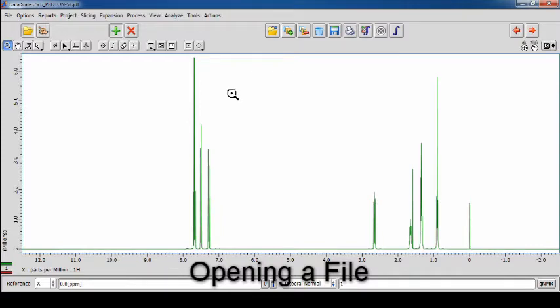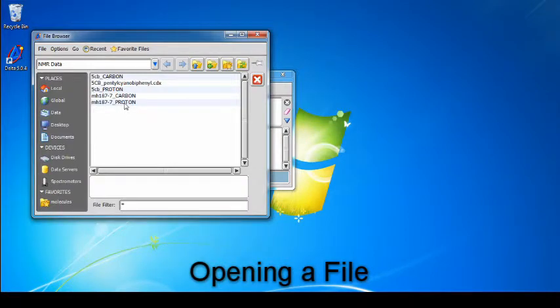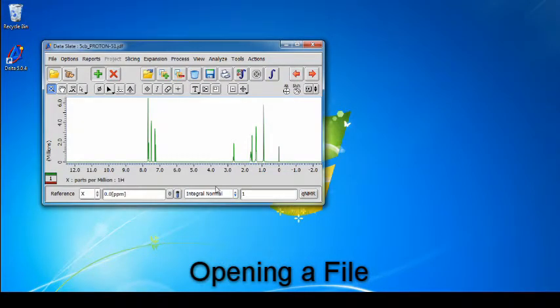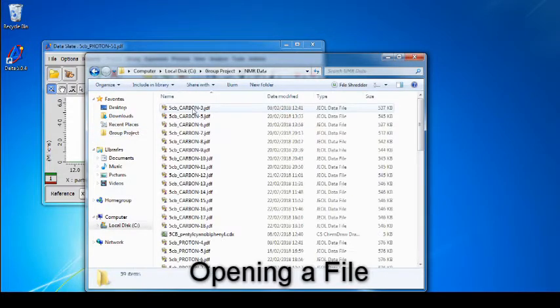This method can also be used to open a dataslate and geometry instance from the main dialog box. Click the Open File button on the main dialog box to open the File Explorer. Browse for the file you want to open and select the file. Next, click either the green tick or the Open Selected File into Dataslate button. You may also open data files directly from the computer's File Explorer if the software is enabled on the computer. To do this, find it in the File Explorer and double-click.